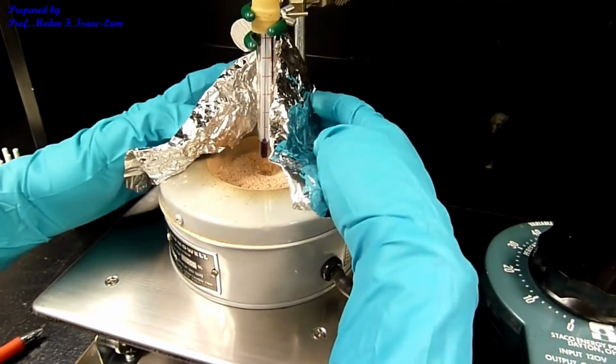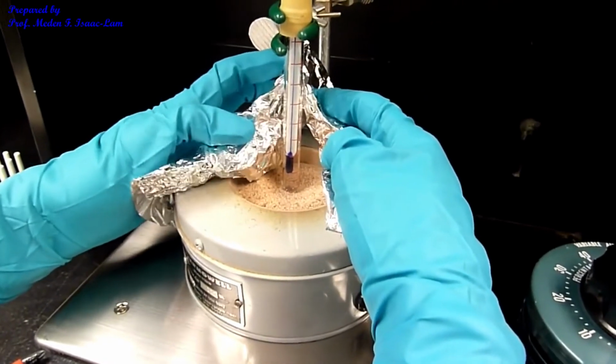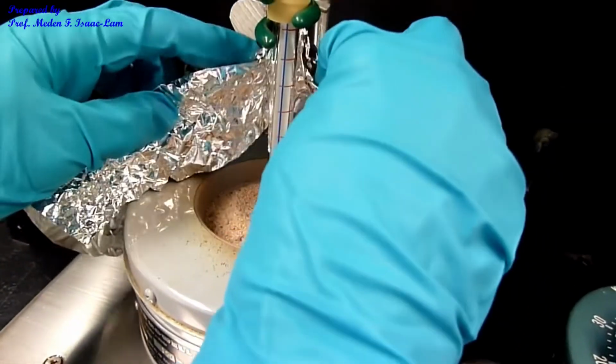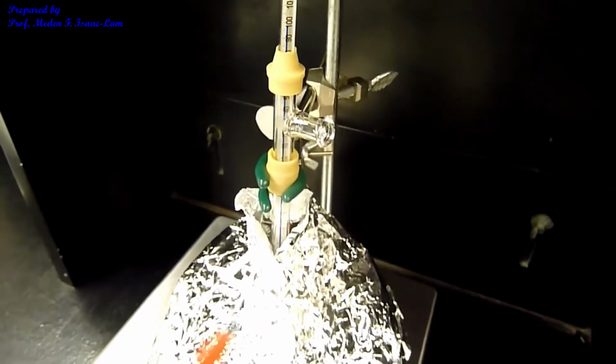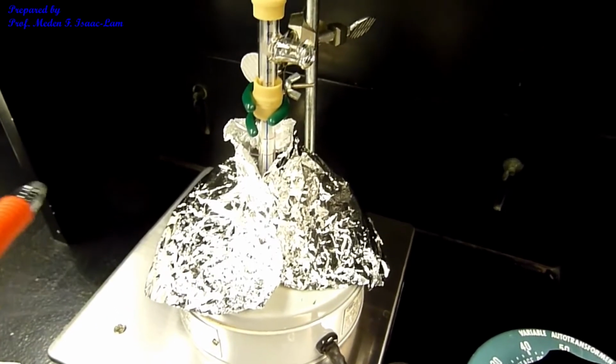But I also still want to see the boiling of the liquid. It's like a shield. So I had the setup pretty much shielded with aluminum foil so I can heat it up fast.